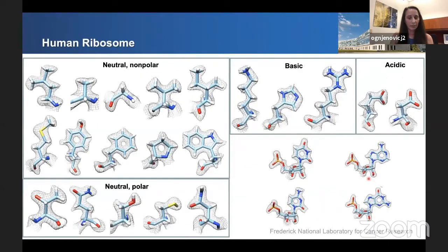To give you a more complete picture of the quality of the ribosome map we obtained, here is a full amino acid panel. And similarly to what we showed for the 1.8 angstrom BetaGal map, here you can see that although the overall resolution of the map is still not as high as it was for BetaGal, in the best parts of the map, we are starting again to see bumps corresponding to the location of hydrogen atoms, along with the usual high resolution features, such as holes in the rings and nicely defined carbonyls. And just as for the BetaGal map, the presence of the hydrogen density in the new map helps us to more easily identify the correct rotamers for glutamines and asparagines.